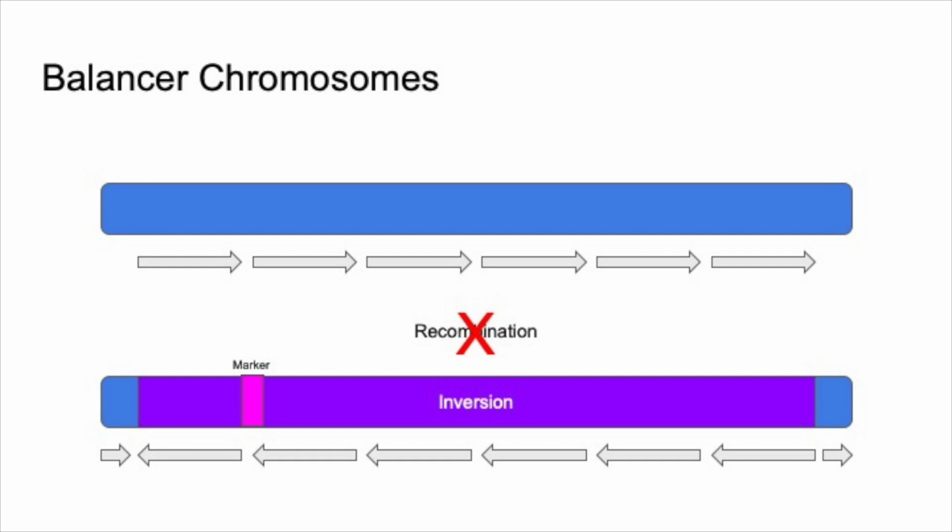There are an enormous amount of uses for these balancer chromosomes. You can use them as an intermediate step in a cross, as you know that any offspring from that cross that contains the balancer chromosome will be heterozygous for the balancer chromosome and your chromosome of interest, since the balancer chromosome can never be homozygous due to the homozygous lethal mutations. You can also use a balancer chromosome to maintain a different homozygous lethal mutation in a stock over a long period of time, since the only viable offspring of an individual that has a lethal homozygous mutation in a balancer chromosome is an individual that is heterozygous for both the lethal mutation and the balancer chromosome, allowing you to maintain the stock almost indefinitely.